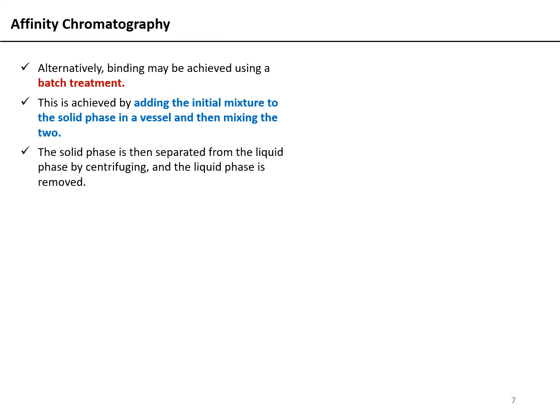Next, you take out the falcon, you centrifuge it at a low speed, not at very high speeds, because centrifuging these beads at very high speeds, any chromatographic beads for that matter, at a speed above 3000 or 3500 rpm will be detrimental to your beads.